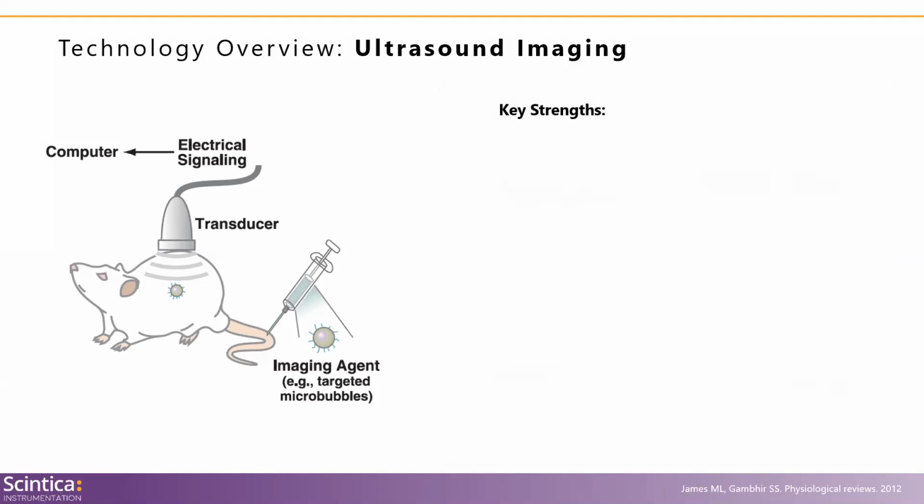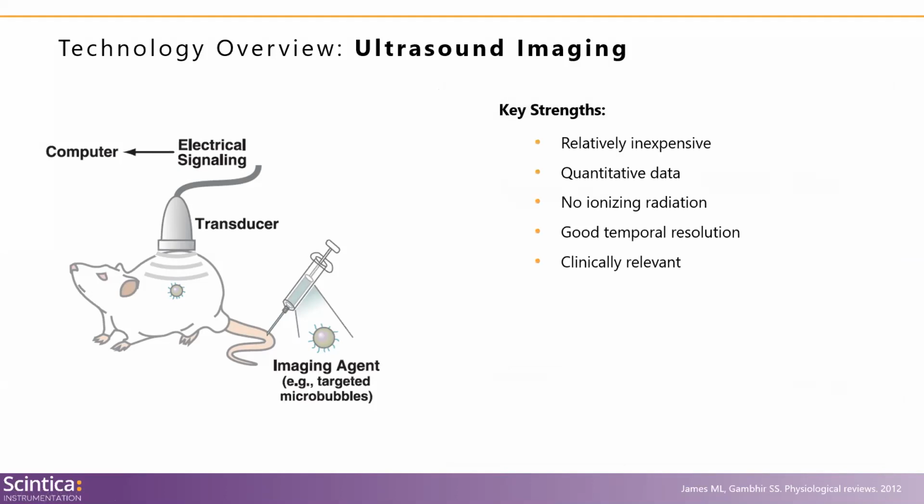So the main strengths of ultrasound include its relative cost effectiveness, especially compared to the modalities we've mentioned already. It's widely available, and it's more portable than these other systems. It has good temporal resolution. It has a good safety profile, so there's no ionizing radiation. It also has excellent sensitivity, especially when microbubbles are used.